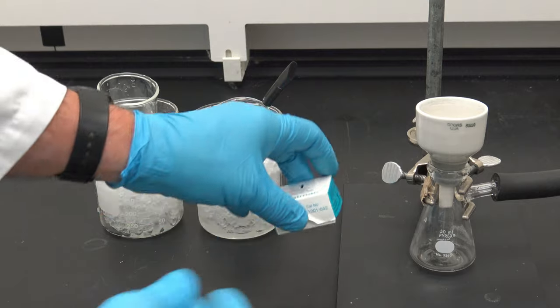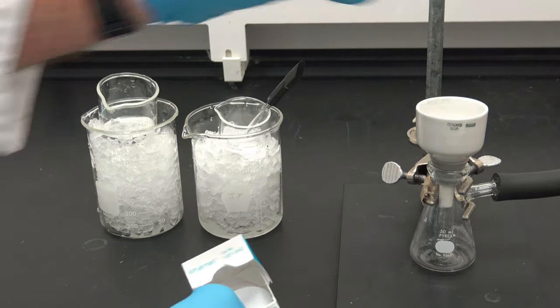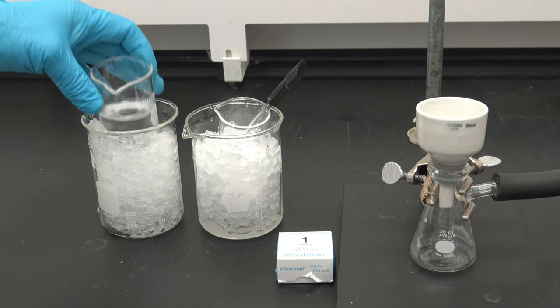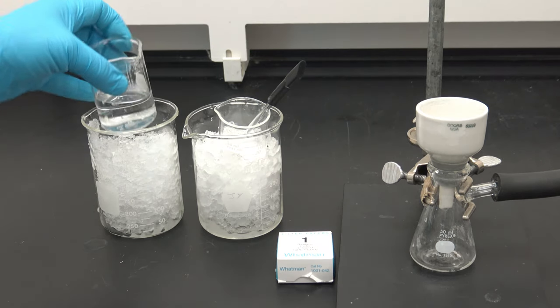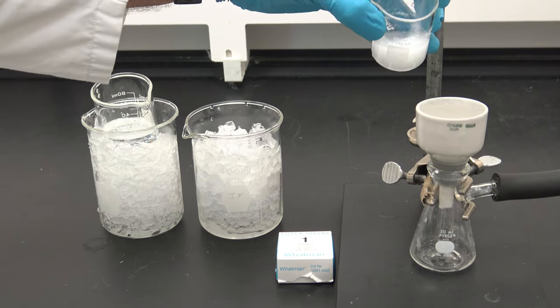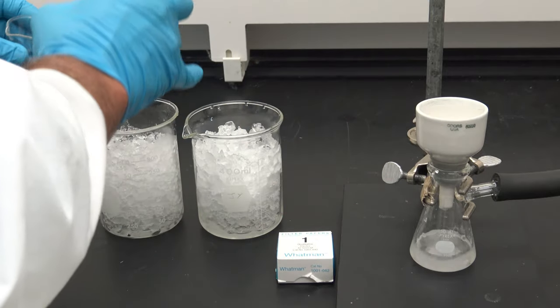I'm going to take a piece of filter paper, put it inside my Buchner funnel. I'm going to turn on the vacuum. Then I'm going to take a little bit of ice water, just again, to seal my filter paper against the bottom of my Buchner funnel. And then I'm going to transfer the contents of my beaker, my salicylic acid, over to my Buchner funnel.